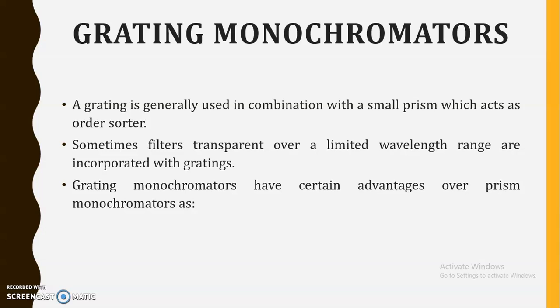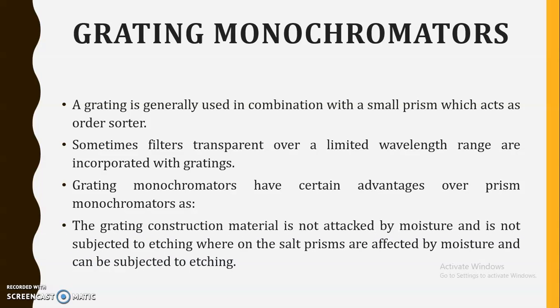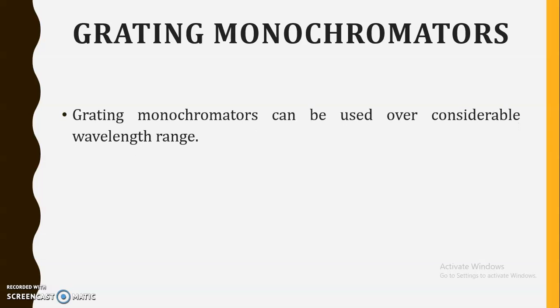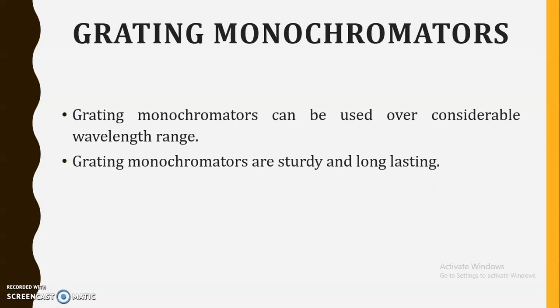Grating monochromators have certain advantages over prism monochromators, as the grating construction material is not attacked by moisture and is not subjected to etching, whereas salt prisms are affected by moisture and can be subjected to etching. So this is one of the advantages of grating monochromators over the prism. Then grating monochromators can be used over a considerable wavelength range. They are sturdy as well as long lasting, due to which these are the various advantages of grating monochromators over the prism monochromators.